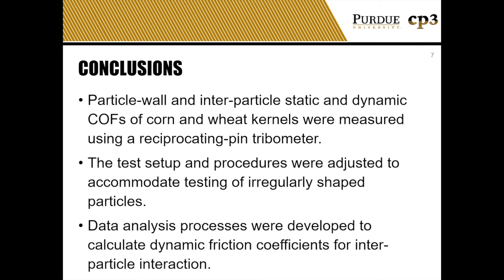This study demonstrates the feasibility of using a reciprocating pin tribometer to measure friction coefficients for corn and wheat. The developed test methodology could also be used to measure the friction coefficients for other types of particulate materials with relatively smooth surfaces.